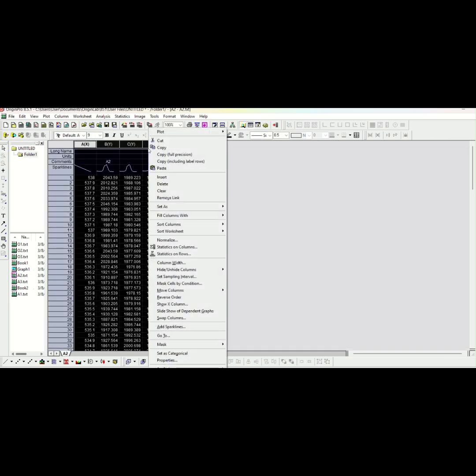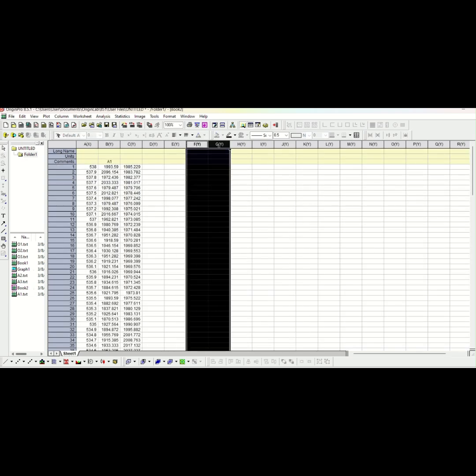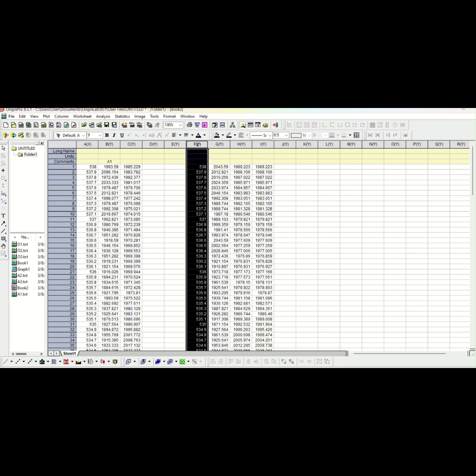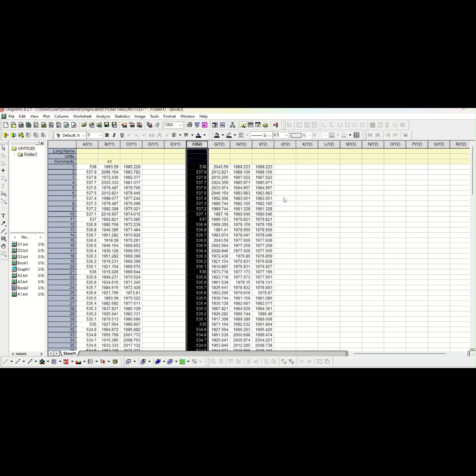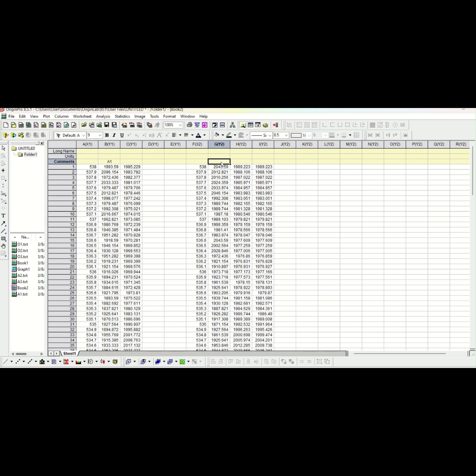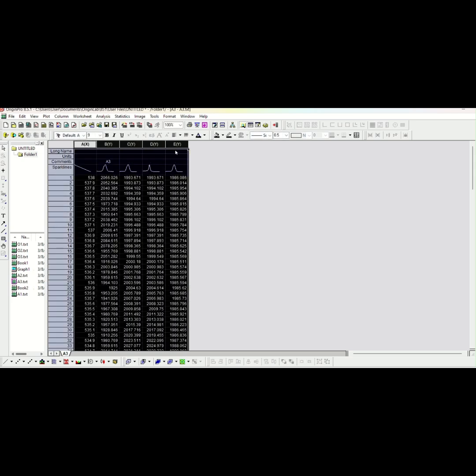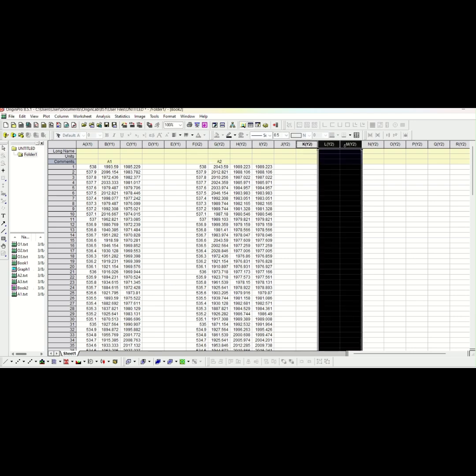Okay, then copy the A2 data and paste into the new workbook. So A2 has 3 y values. So set as X and name it A2. So this A2 has 3 y values. We need one more column to make it 4. Okay, then copy the fourth data for the number of y values sample, that is A3. Copy that and paste.